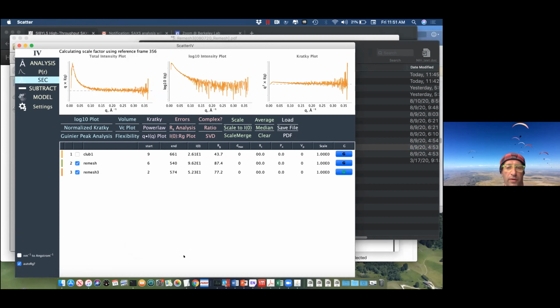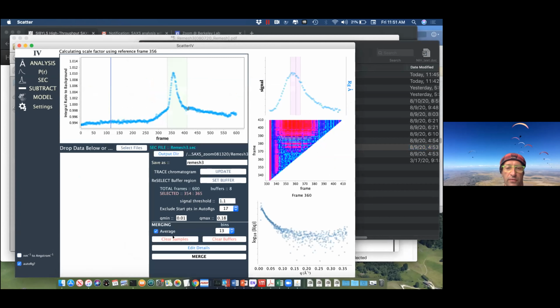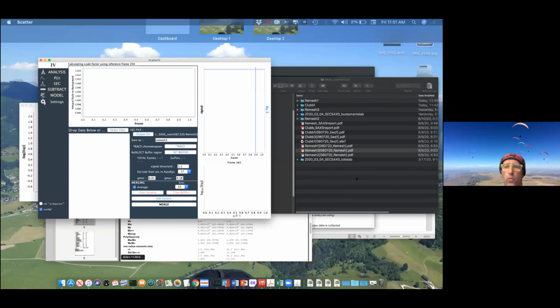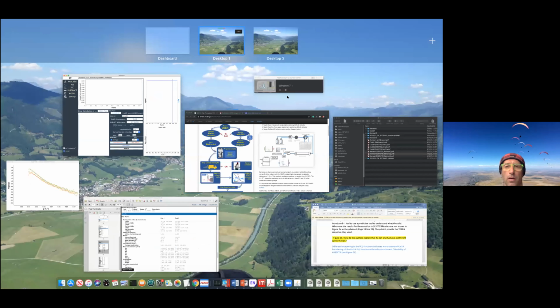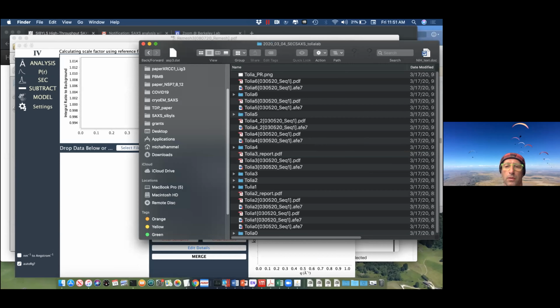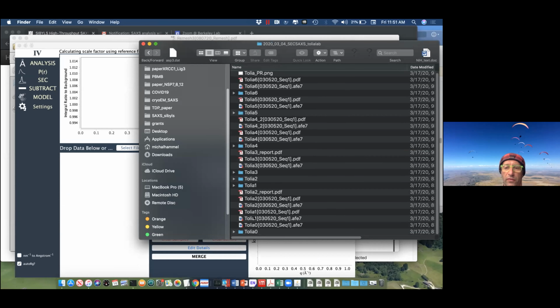The purpose of this 1 hour discussion is not to go into data analysis, but how to process the data and understand it. I forgot to mention that, let's just take one random sample. Okay, let's just take this one the user told me about, this March, so it's close.